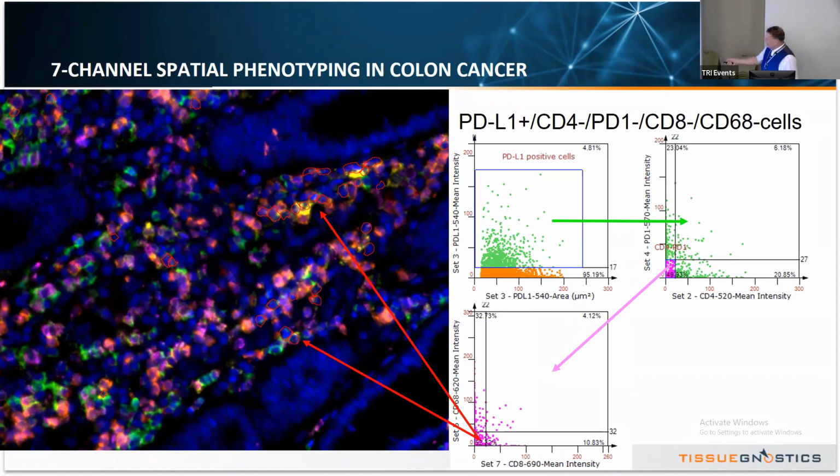Of course, all the raw data behind these scattergrams can also be exported in a kind of list mode and then analyzed in one of the big statistics applications like SPSS for further analysis.